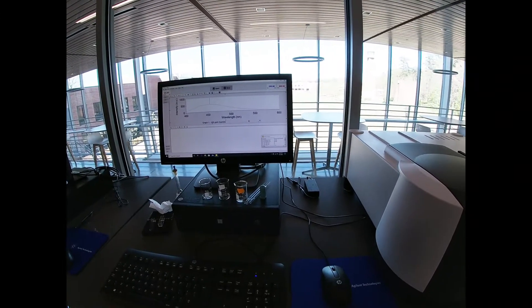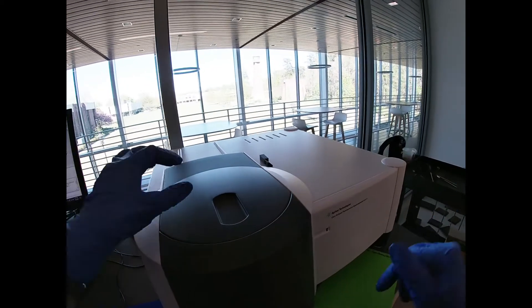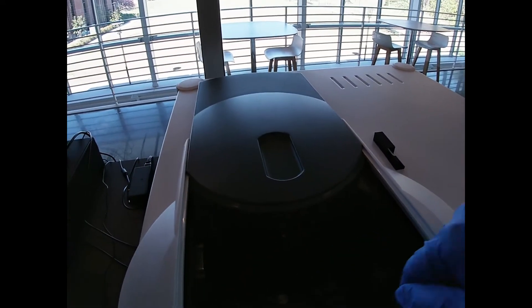We're going to do our analysis using the Cary Eclipse Fluorescent Spectrophotometer. If we take a look inside, this is our sample compartment.